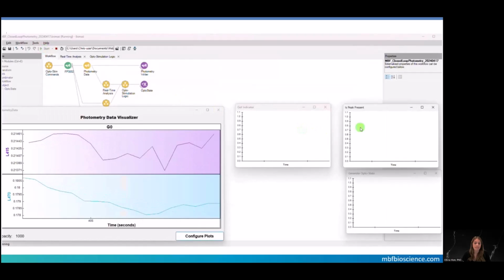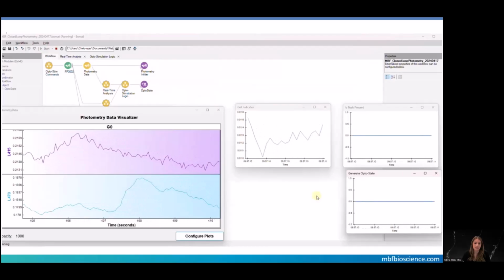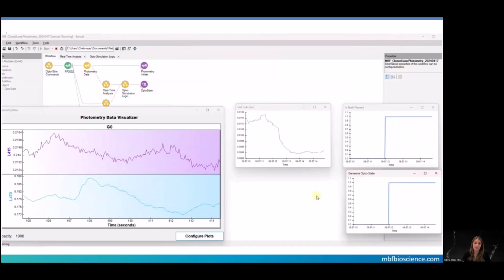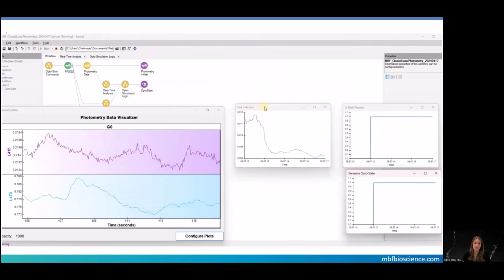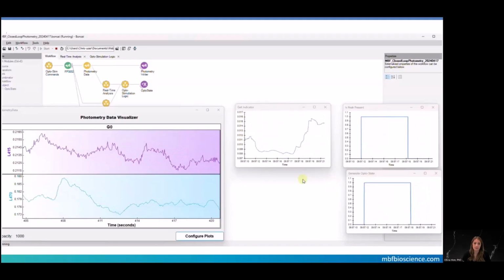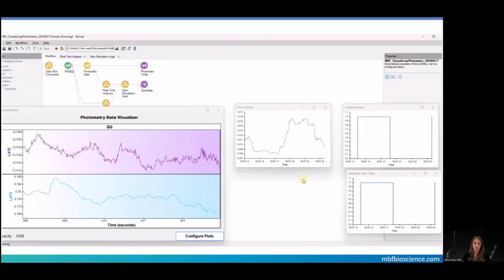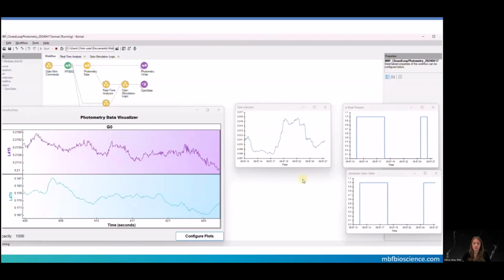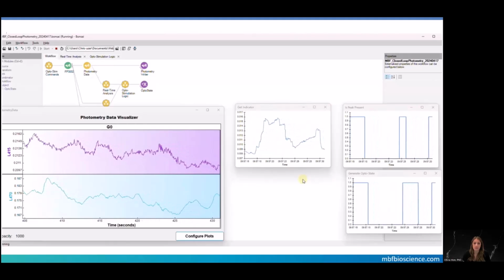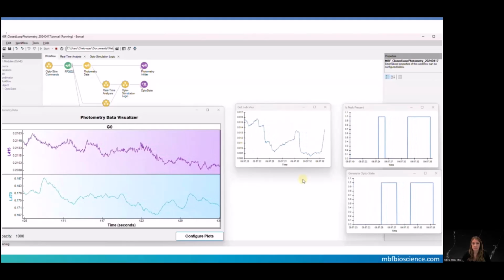Now these 3 nodes are going to take a little bit longer to populate because we have a longer buffer duration. Our buffer needs to fully populate before we run our real-time analysis, so it's going to take a couple frames to start our real-time analysis. An important note is that although we have a longer buffer duration than before, we have not induced any more latency to the detection of peaks. When a peak occurs, we will still nearly instantaneously detect it and then trigger opto-stimulation accordingly.